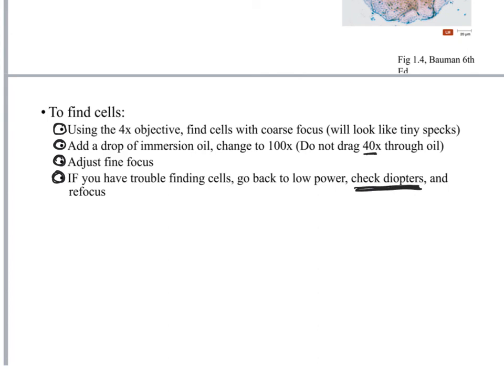If you adjust that back to the center, then it will make your scope more parfocal. I'll explain that a little bit better when I can show you, but never be afraid to mess with those a little bit. Put them back on the setting that I'm going to show you, and then hopefully you won't have to focus as much when you move up to high power.